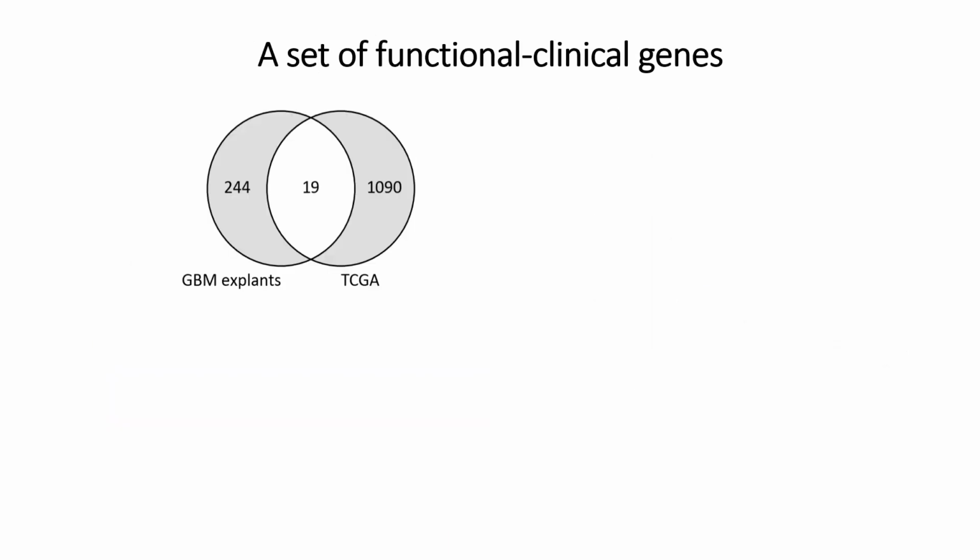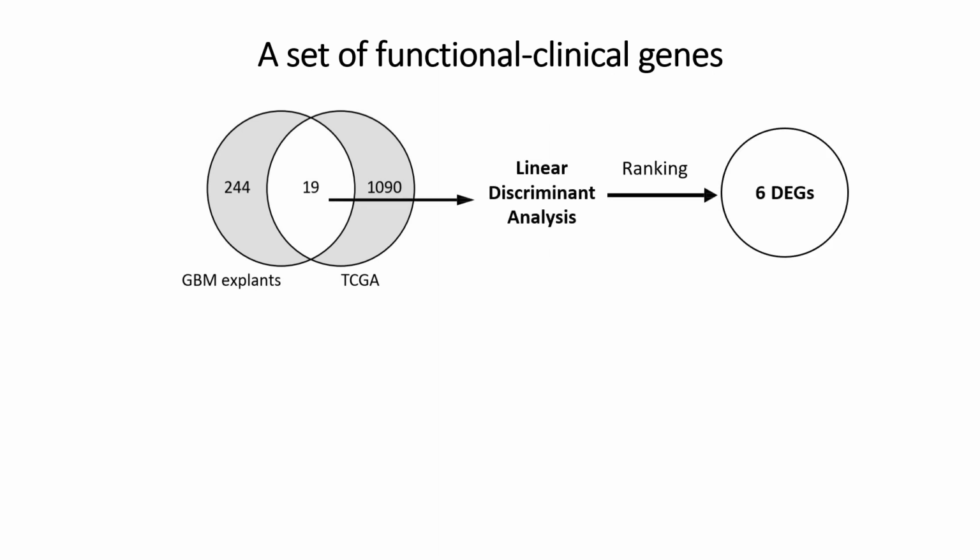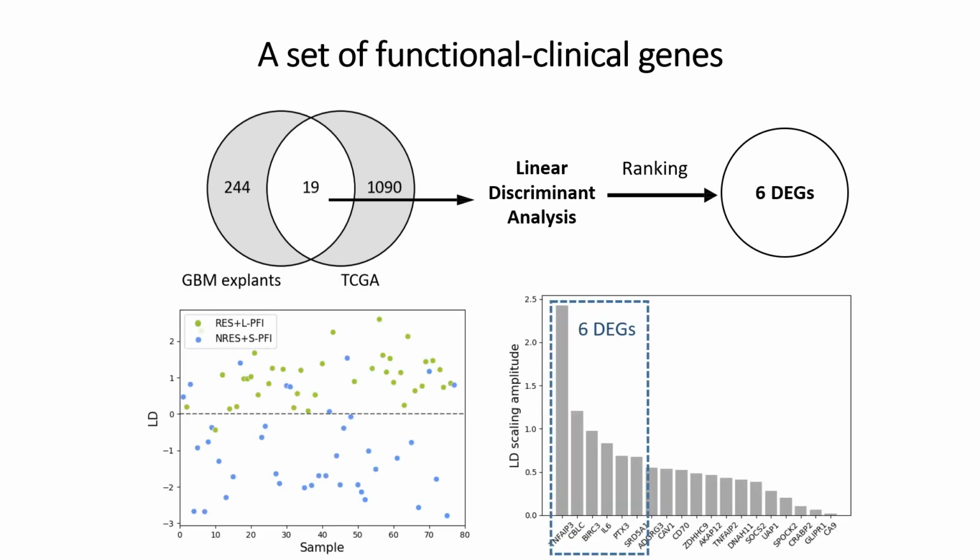We then intersected the two sets of differentially expressed genes, finding a non-null set of intersection. This subset of differentially expressed genes therefore represented the ones indicated by the FLIM that also carried clinical information about the disease containment. Among them, using a discriminant analysis, we selected the ones with the highest capacity to discriminate between responsive and non-responsive samples.